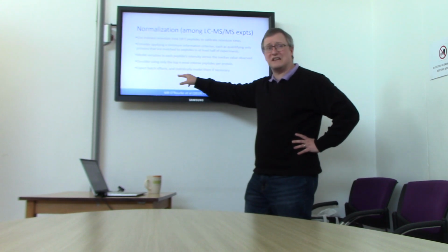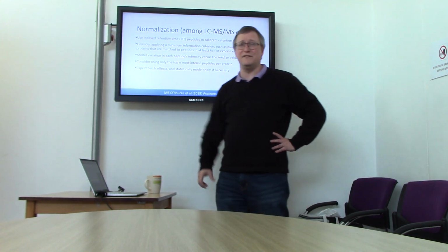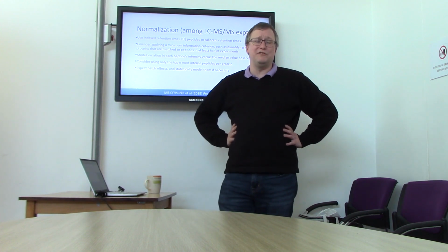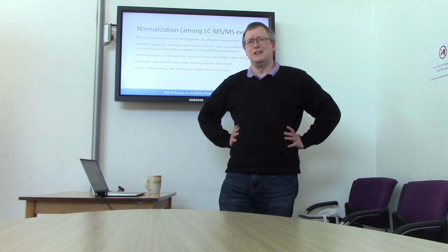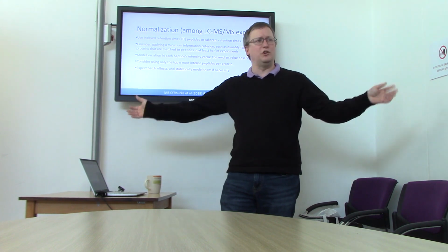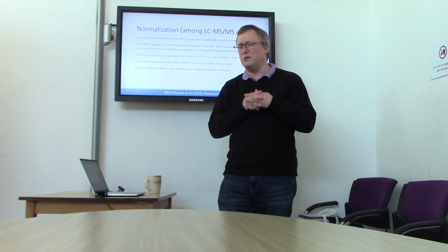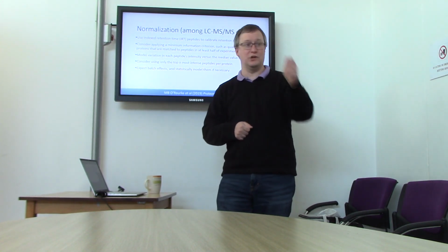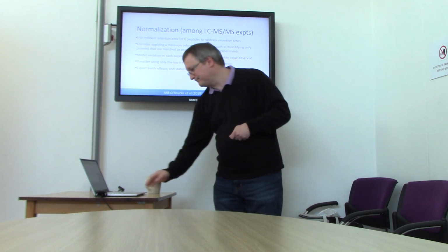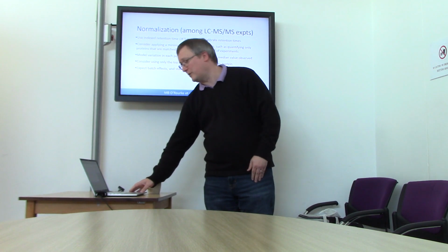You should expect batch effects, and you should statistically model them if it's appropriate in your study. If you run a bunch of samples in January and another batch of samples in June, don't expect that those values can all just be tossed into one hopper and run together. You should probably make use of a statistical model that has a specific term for which batch these experiments come from. So I thought all of this was really good advice, and it's a useful place to start.